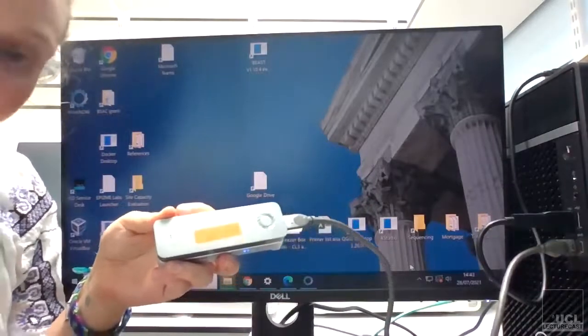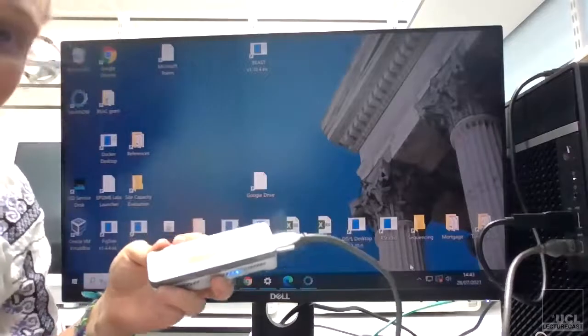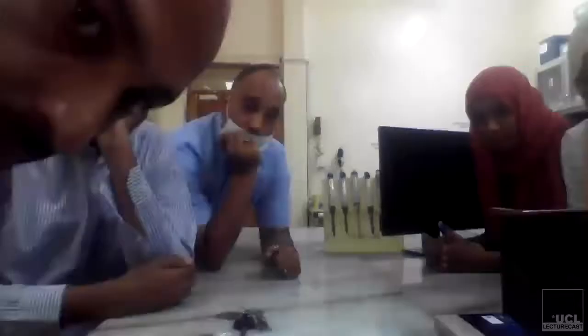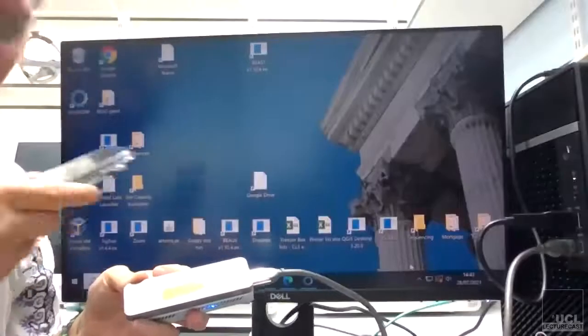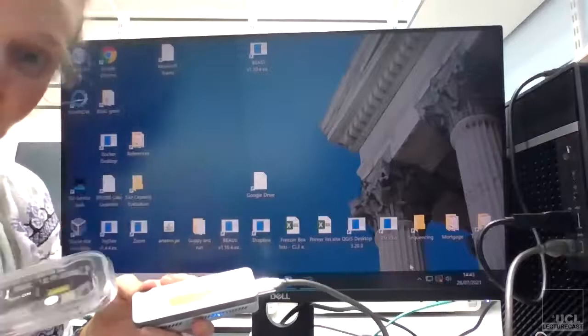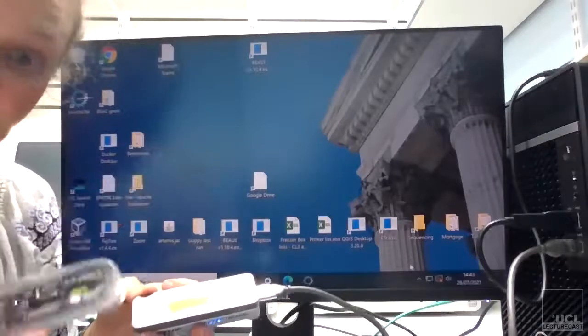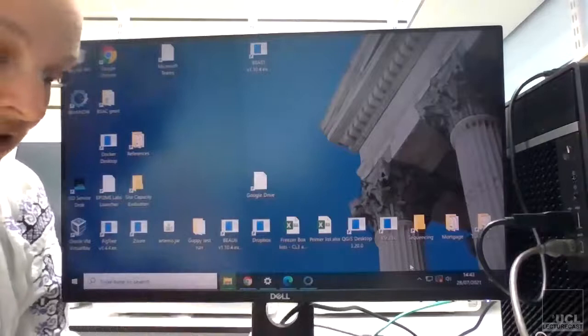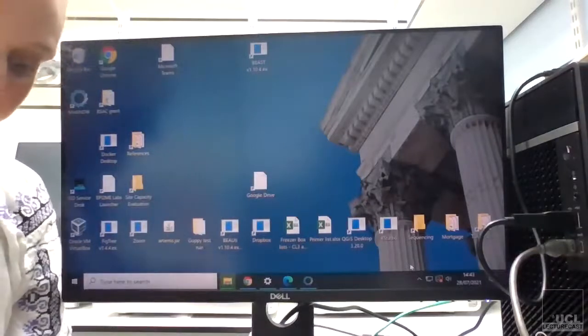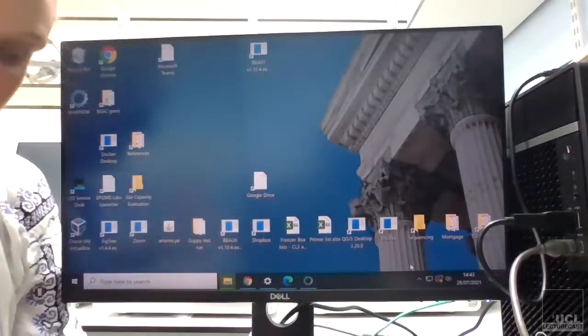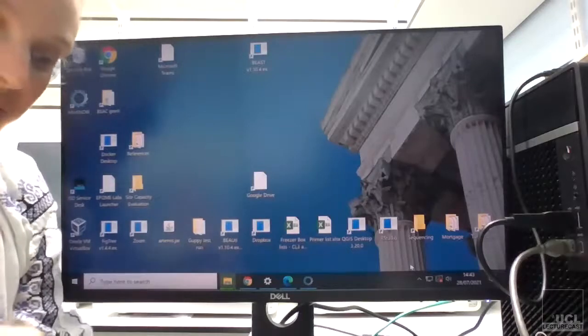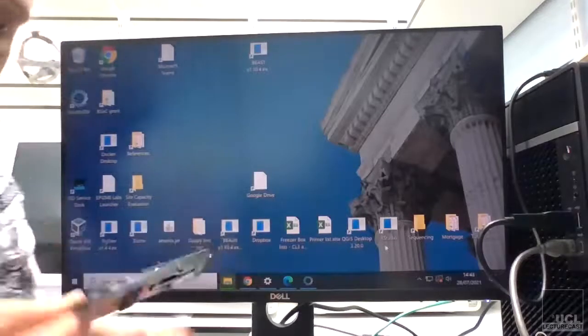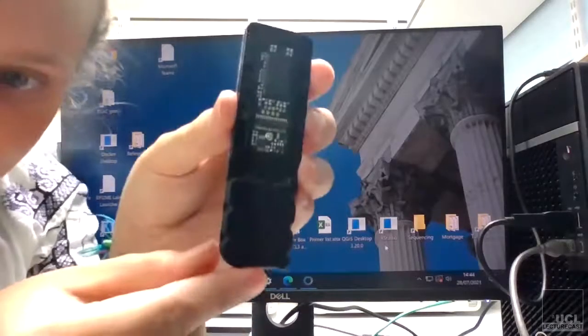It's the same principle, and hopefully you'll see that on my big screen it will be the same MinION software as the one that you can see on your screen. The first thing you need to do is take your flow cell out of its little packet, and you should be able to see that there's a computer chip thing at one end.